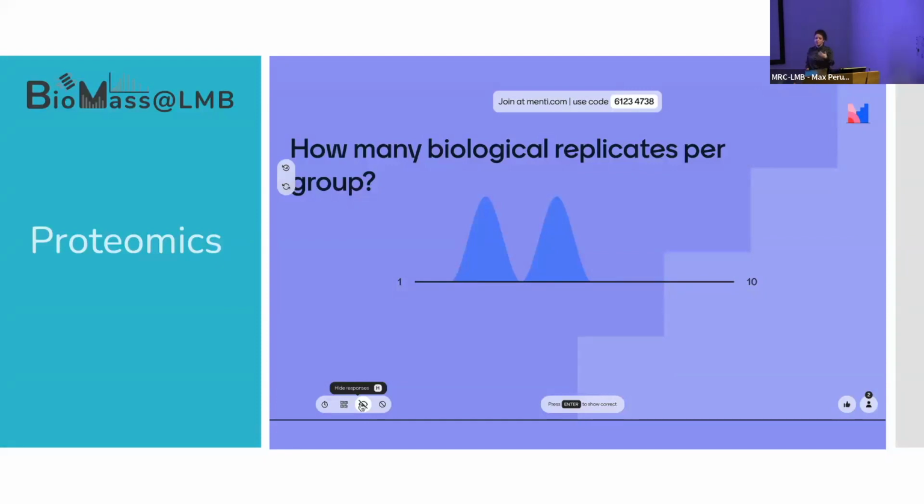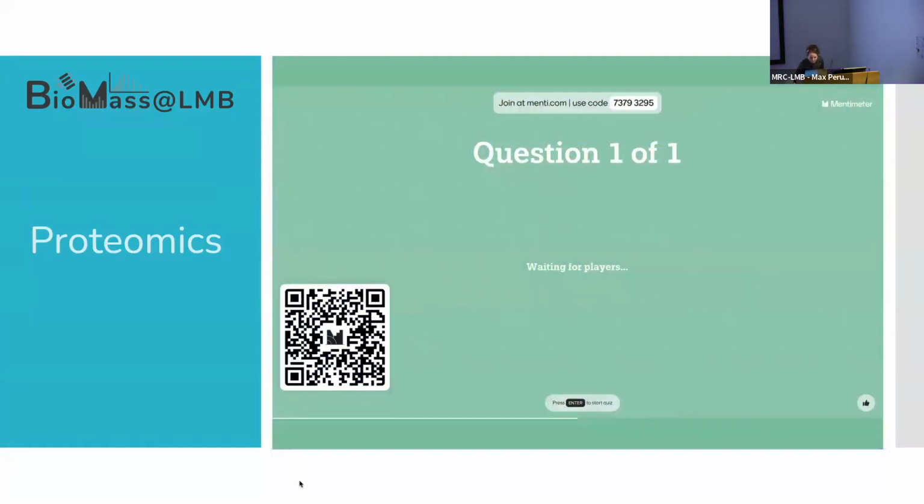If you're working with mouse, that usually carries a lot of biological variability. It's normal. It's a whole organism. So probably need to do n equals 5, sometimes n equals 6. But we'll work with you. So this is a dynamic process. Sometimes it works really well, 3 biological replicates in one go. Other times we need to repeat the experiment, and that's fine. The next one.